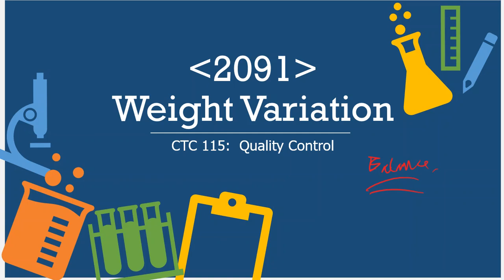If it's more than 25% variation, though, no matter what, whether it's a capsule, whether it's a soft shell, hard shell, tablet, coated tablet, uncoated tablet, all of those have a strict threshold of 25%. If any one of them is greater than 25%, the entire thing fails. It does not work, no matter what the other material might calculate out to be too. So that is the mother percentage that you are after. 25%, no more, but 10% or less is going to be the ideal.